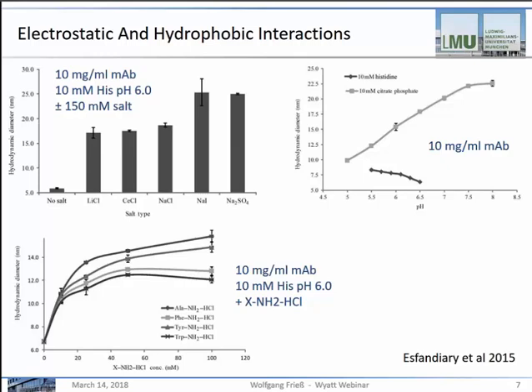Considering histidine buffer, however, you can see that the hydrodynamic diameter hardly changes. As we had learned before, the anionic species are very important for the cluster formation of this protein. With citrate and phosphate negatively charged, these anions trigger this cluster formation, whereas histidine, as the positive buffer species, does not affect this.